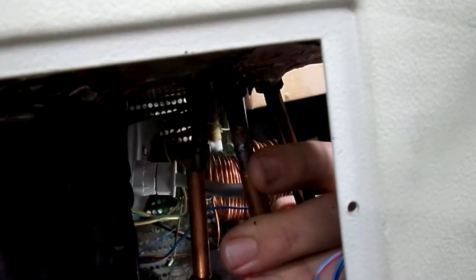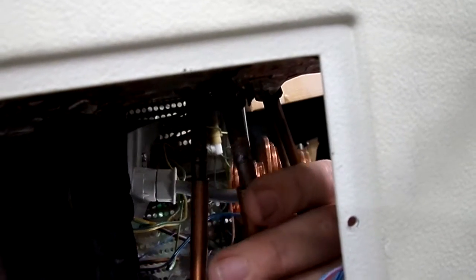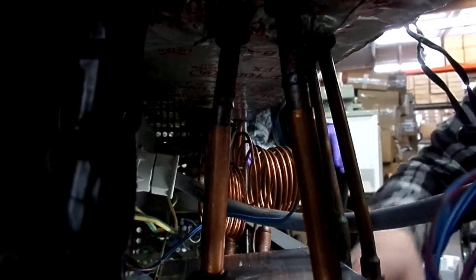There we go. Okay, this is another situation where I'm going to have to heat the lines up a little bit before they'll really sit in place. As you see, that fits pretty well. Typically, since this one has been done before, that's why it fits now.